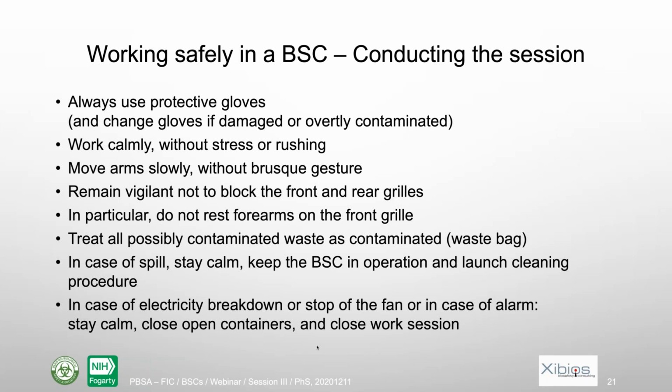Very important, we need to always be careful not to block the front and the rear grills. The front grill, it's quite obvious, but the rear grill is also very important. In particular, we should not rest the forearms on the front grill, and if we work for a long work session, and we tend to do that, we should really look for some type of armrest. All contaminated waste inside of the cabinet should be put in that small waste bag or container.